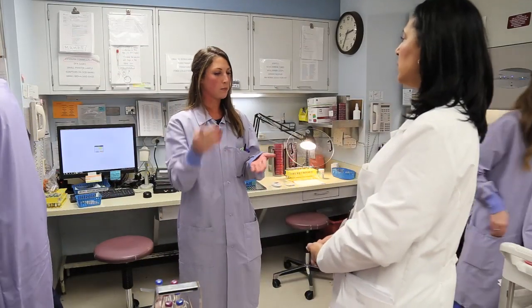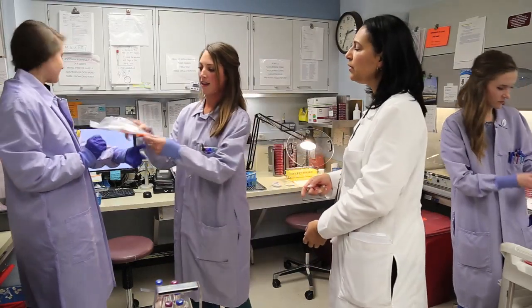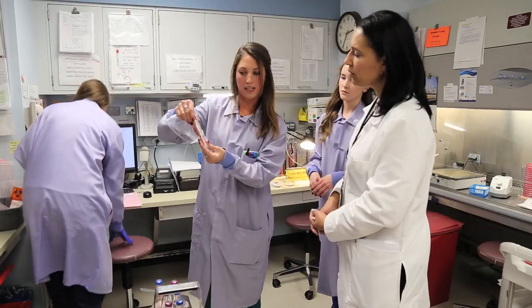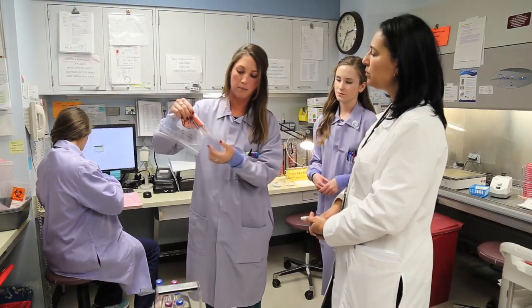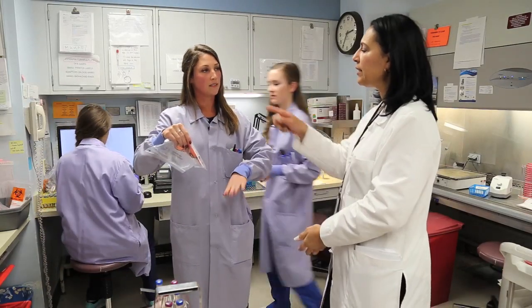And so once you put the swabs in there, it takes a few minutes to equilibrate. This one is a little bloody, but it will turn pink immediately, and once it sits for about 15 minutes, it will equilibrate back to this clear color gel, and that's how we know it's in an anaerobic environment.